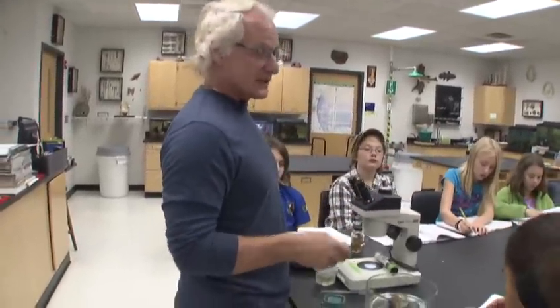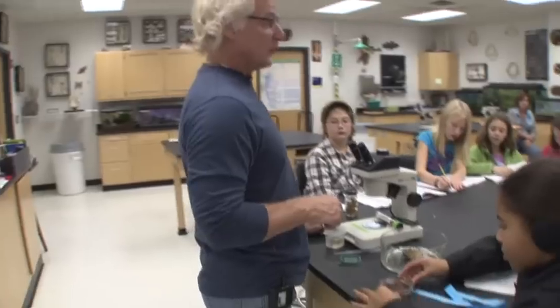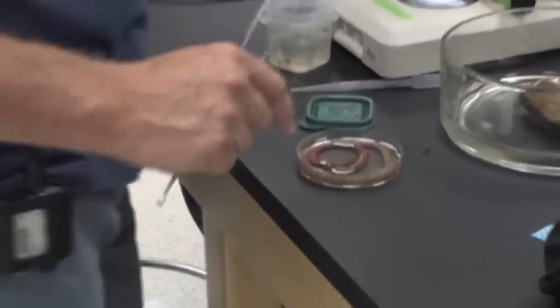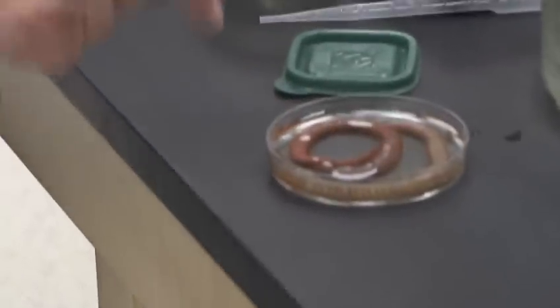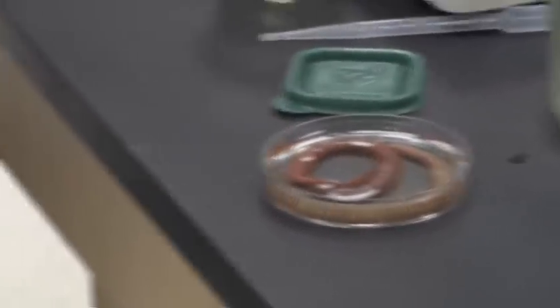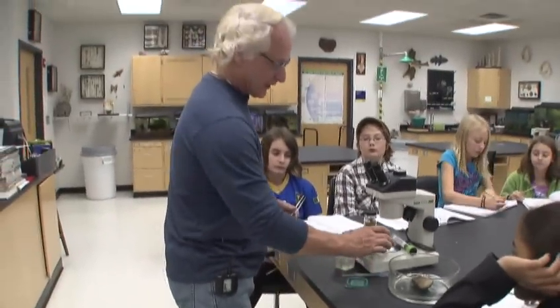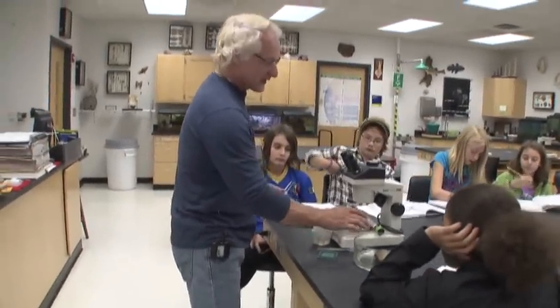These guys have a little larva called the trochophore. And so do some of the mollusks. They have a trochophore too. So we know they're united and they share a common ancestor. But they don't look much like mollusks now, do they? Except that they're soft-bodied. So we're going to look at this thing again soon because I want you to look at the setae here and also the parapodia that stick out, all right?